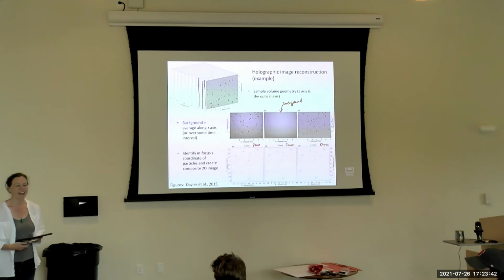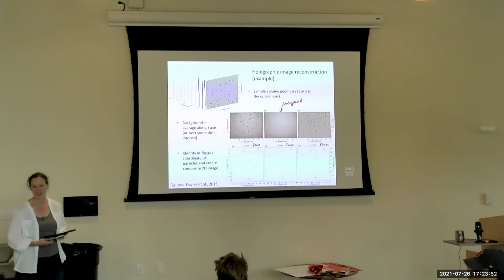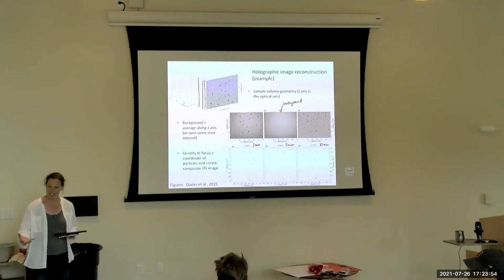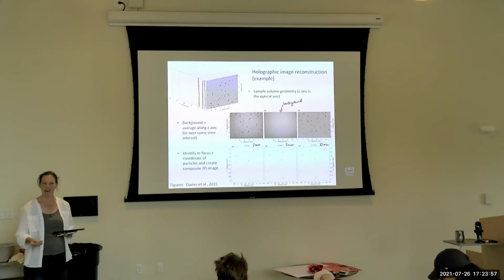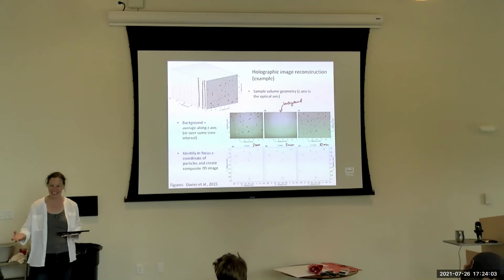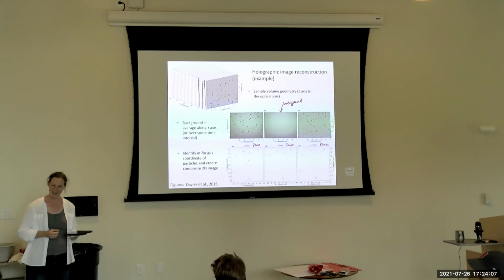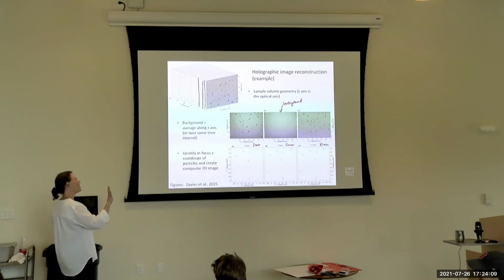Yeah, virtual reality. Yeah. So I was on a cruise 4 years ago now with a bunch of people. But Melissa Oman has a DIHM digital inline holographic microscope. It's one of the 2 commercial sensors available right now. And she used it, and on board we had this computer scientist who did augmented reality. And so we had literally VR goggles and a projection system on board. And we could look around inside the sample.